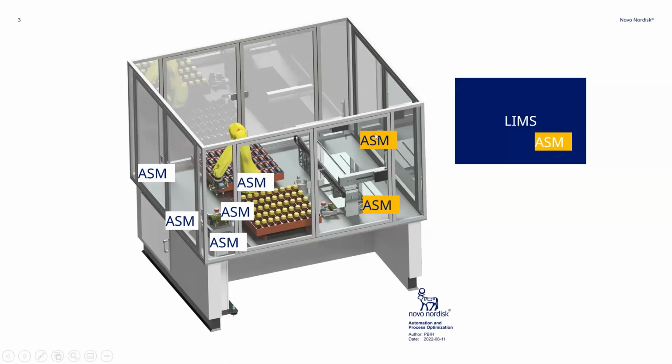And this one is a PLC that we use with the same philosophy. Of course, we're never going to be able to standardize many of the things of a PLC, so we have not really tried to push that to Allotrope. But maybe we'll have some discussions on how we can do something generic enough that it makes sense to add.